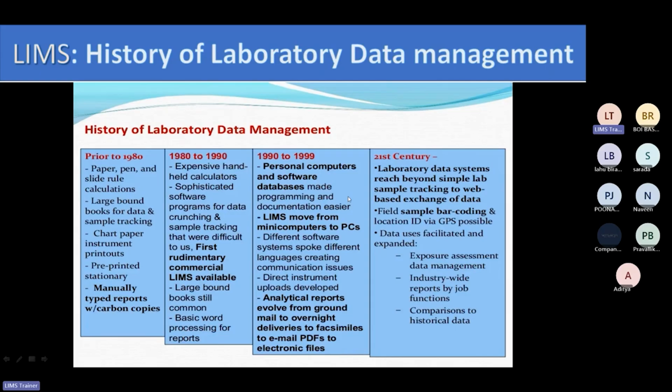They did the calculations on their own, then recorded them. They needed to print the report. They recorded all the data on paper and took the printout, and that is how the laboratory was working.